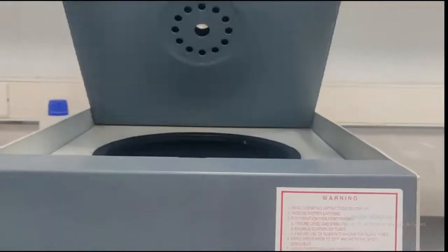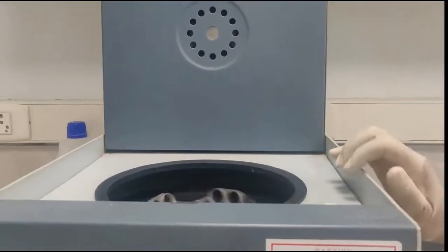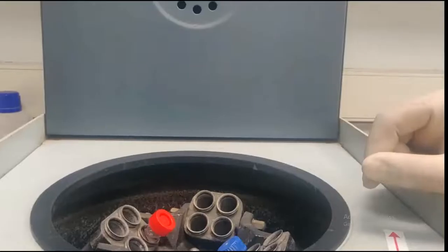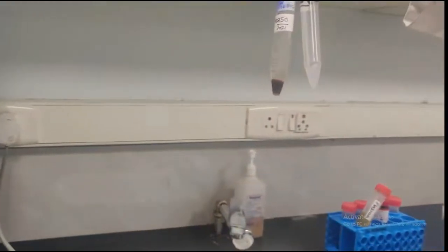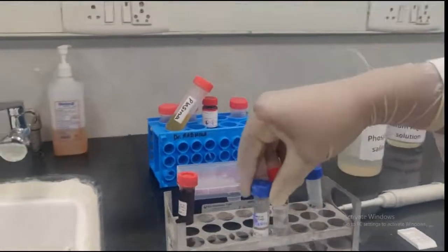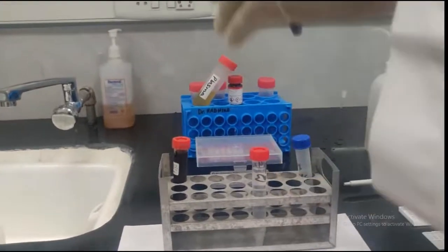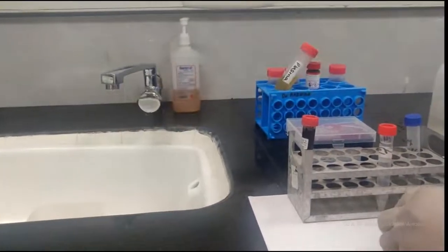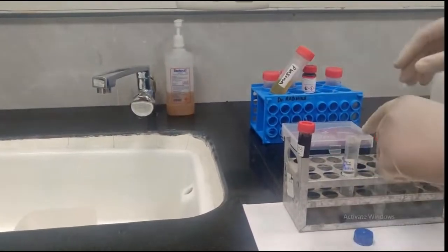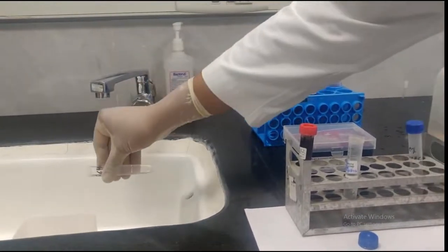So now the second centrifugation is over for the washing step. The tubes will be taken out. You can again see pellets have formed at the bottom. So now again the supernatant will be discarded. Similarly, for the second sample, the supernatant will be gently discarded.